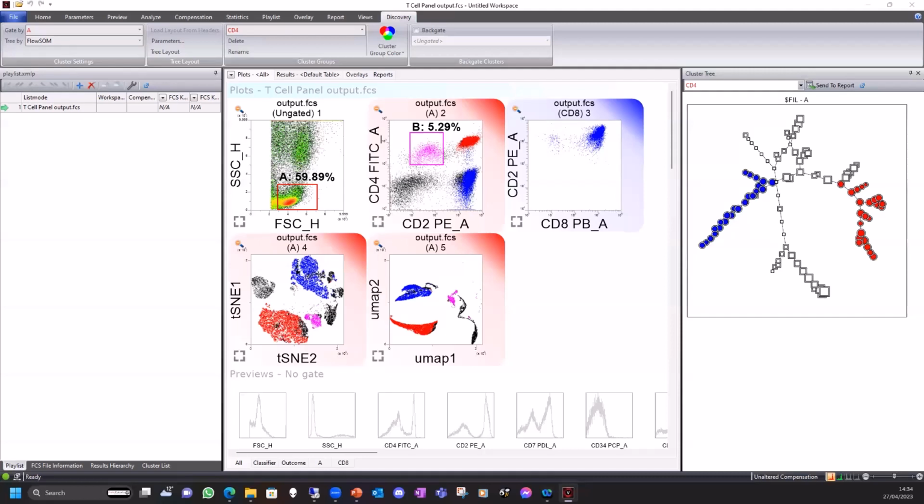Pete, is there a limit to the number of files that you can merge together? No, the size of the files really is what limits the merging. I think it's about 9 million events. I think it's limited to, Mark. Thank you.